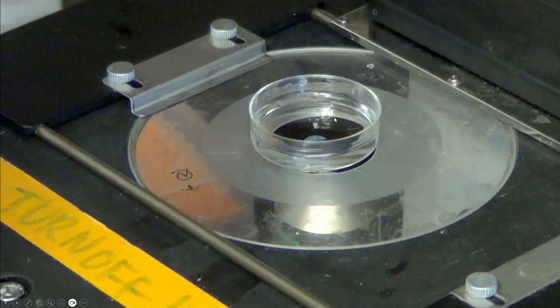But remember that the slice has undergone quite a bit of trauma during the slicing process. We will transfer all these washed slices that are in Hanks balanced salt solution to a slice media, a cell culture media that I'll discuss in a minute. But the slices will need about a day, probably 24 hours at least, or maybe 48 hours to recover from the trauma of the slicing process.